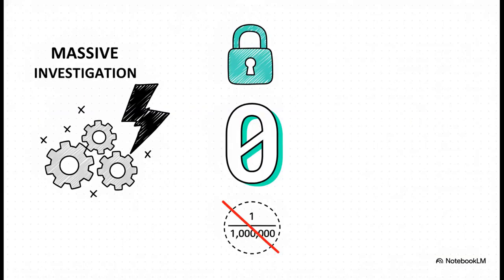So the crucial point is this: absolute zero. The target acceptance criteria for a media fill is 0 contaminated units. I want to forcefully contrast this absolute zero tolerance against the calculated probability we saw earlier. Remember, terminal sterilization accepts a mathematical probability of 1 in a million? In APS, 0 tolerance. Any contamination triggers a massive investigation and potentially a complete revalidation of your line.